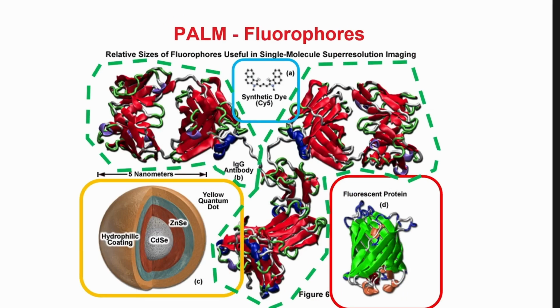Typically, again, this has to be combined with wide field fluorescence microscopy. Otherwise, from this pointillistic image, you don't know where you are, for sure. So you need a lower resolution image, and that's typically just a wide field fluorescence. What kind of labels can you use? Well, you can use fluorescent proteins. You can use synthetic dyes. So fluorescent proteins are expressed by the cells, and synthetic dyes you just add to the sample.